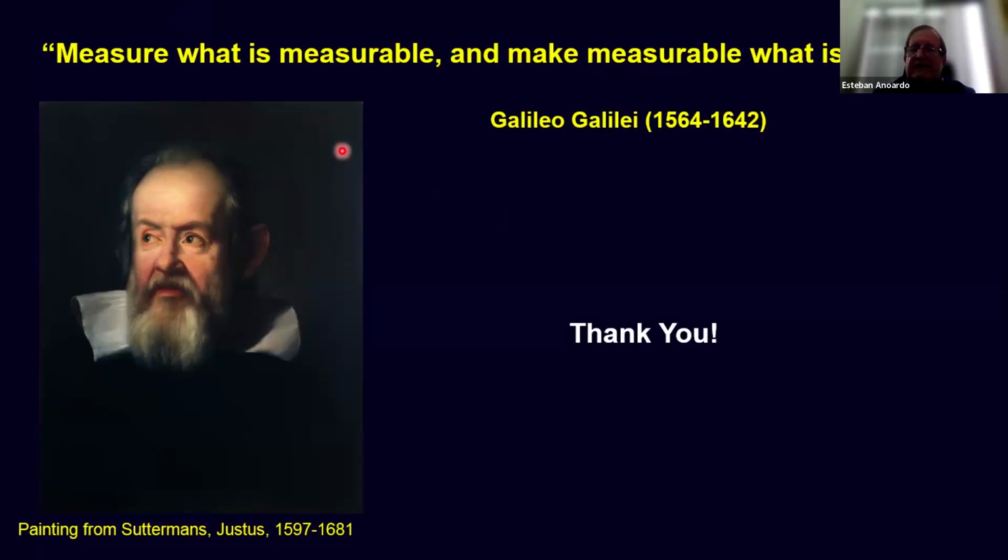So all the rest you say is mere speculative argument, sorry. Unless you validate the model by contrasting the parameters you get with field cycling against the results from other techniques, at least the more important parameters of the problem, or you generate synthetic data like we did and check that you can recover the generators, it's difficult to say that you can trust the model.